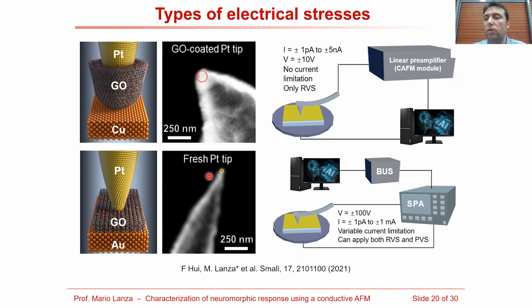We have also calculated the effective contact area between the tip and the sample using the Hertz model, and we have observed that here the contact area is 8 nanometers square, and here is 50 nanometers square. And then here there is the really good innovation of this project, which is we have used a standard conductive atomic force microscope to measure electrical properties of these material systems.